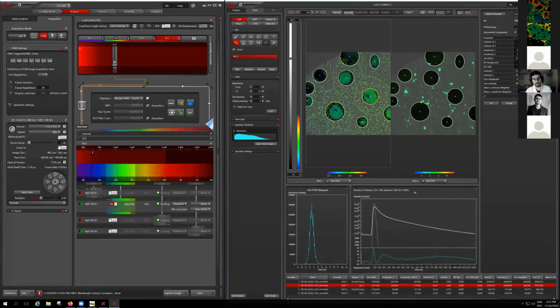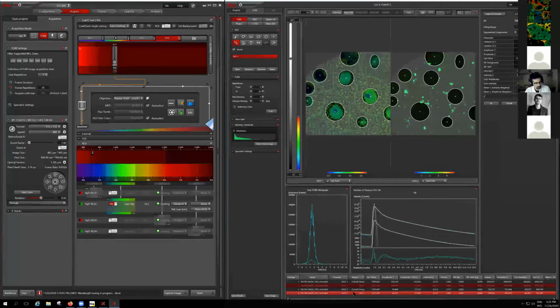So the whole idea for the pixel-wise fitting is that you do the fitting in the region of interest in the field of view that you are interested in. What we have done is the overall decay, the whole field of view, and then I have the ROIs. I'm interested in doing the pixel by pixel fit on the ROI, so with Control, like normal Windows, I can choose the 2 regions of interest that I have in 2 channels. And then I click on the FLIM image.